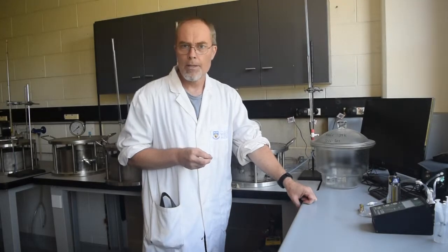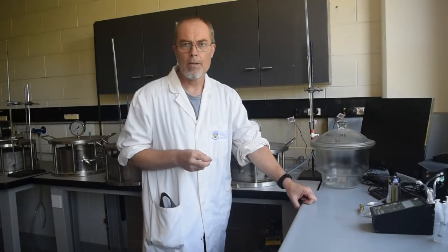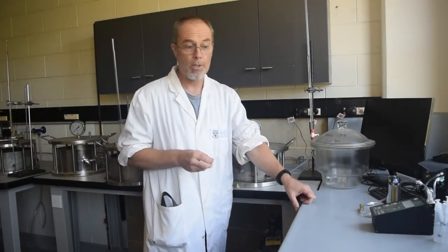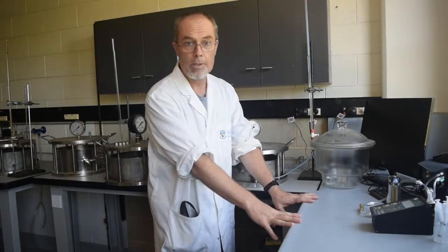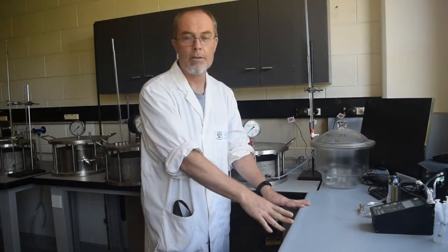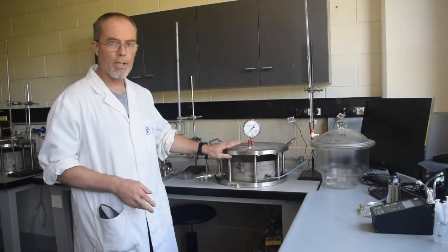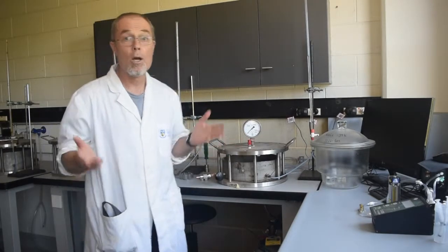In terms of safety, there aren't really any serious safety issues for you. We do recommend that you wear lab coats at all times in the lab, just because there may be residue on the benches which could do nasty things to your clothes and to keep yourself clean. The more potentially hazardous work with high-pressure gases we will do for you.